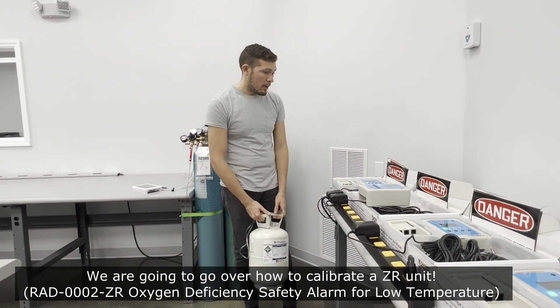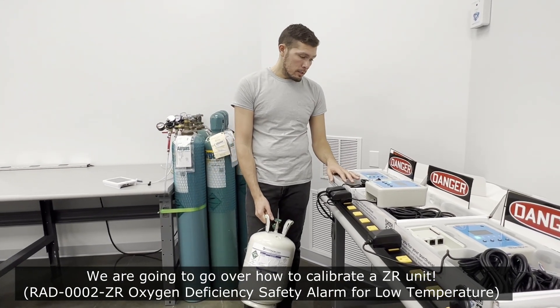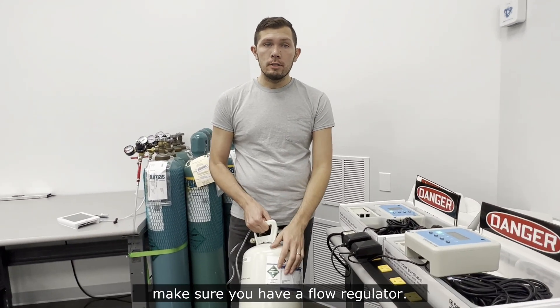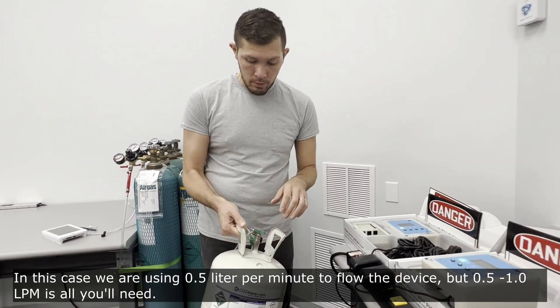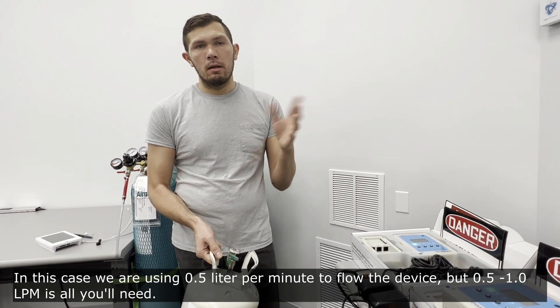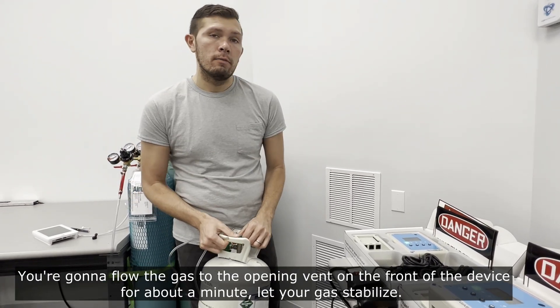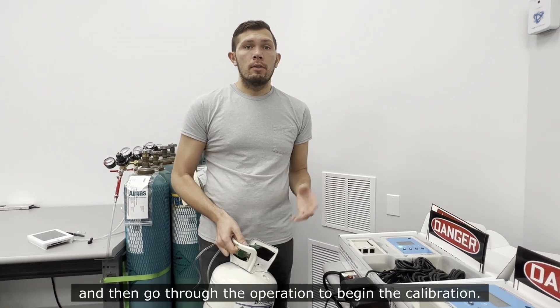We're going to go over how to calibrate a ZR unit. To do this, you'll need to buy calibration gas from your local provider — make sure you get 21% oxygen. You'll also need a flow regulator; in this case we're using half a liter per minute, though anywhere from half a liter to about a liter per minute is sufficient. Flow the gas to the opening vent on the front of the device for about a minute and let the gas stabilize.